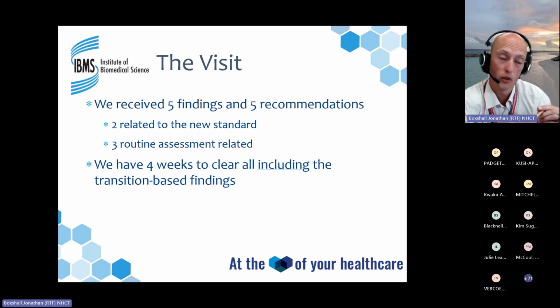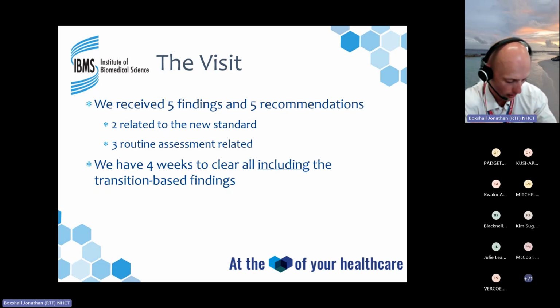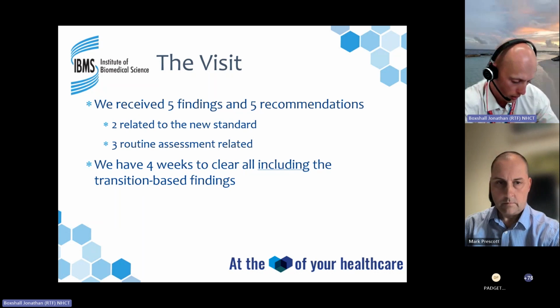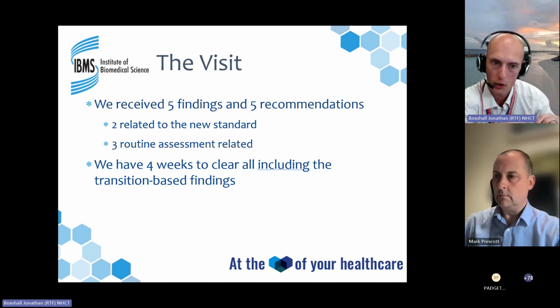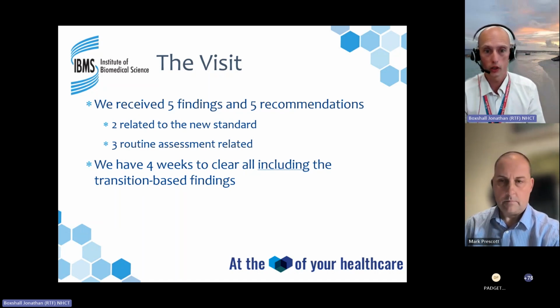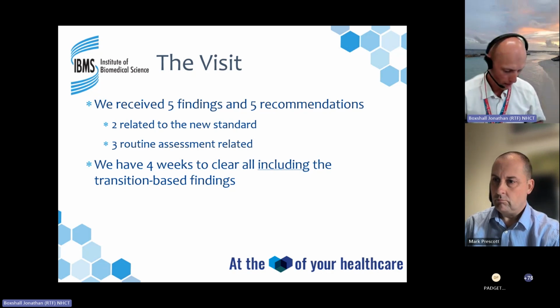What I then did is thought, well, I'm going to take that audit out, because there's no point auditing good practice, but where the bad practice is, which is the document review, we'll put more document reviews in to cover that. So I've manipulated the calendar to fit in with what findings we're getting, and that's now being documented as a CAPA. So next time the assessment manager comes, when they ask how we do it, I can present the CAPA and go, well, here's the review, this is what I did and why I did it, and there you go, evidence all there.